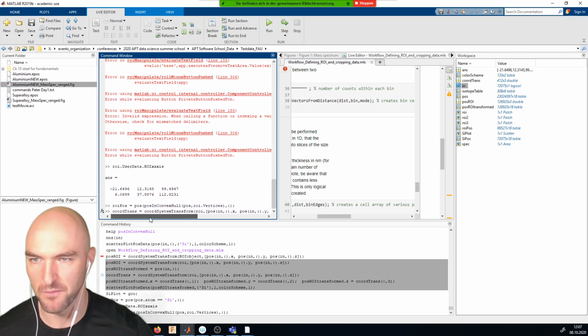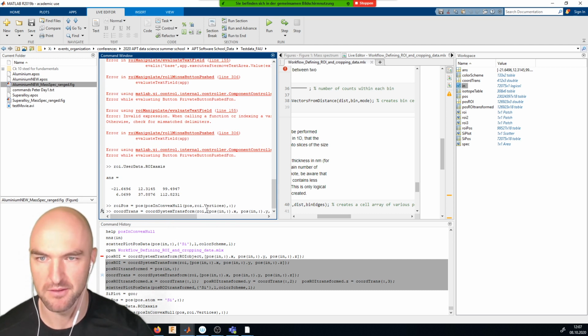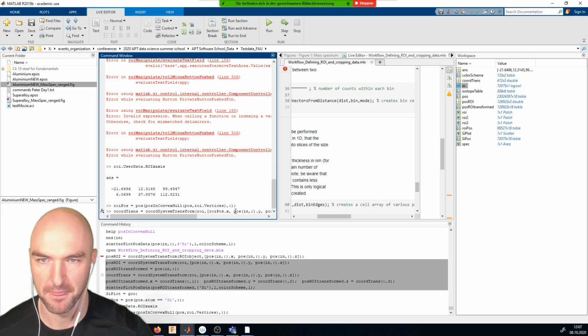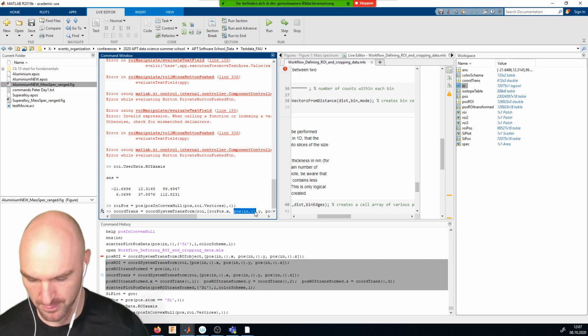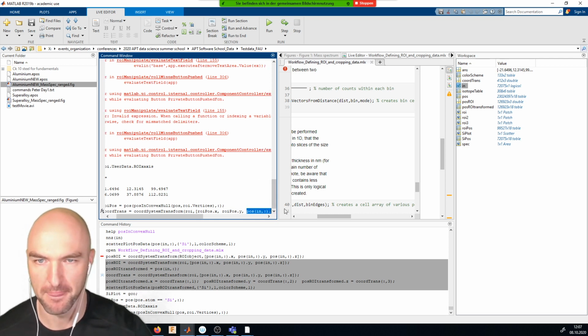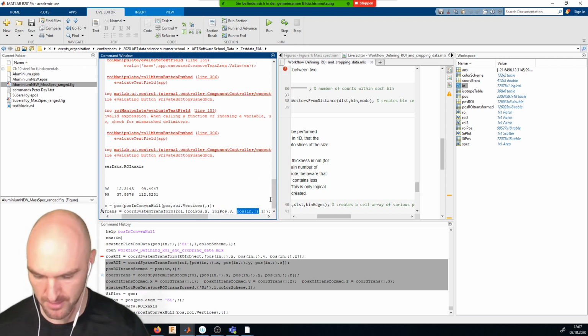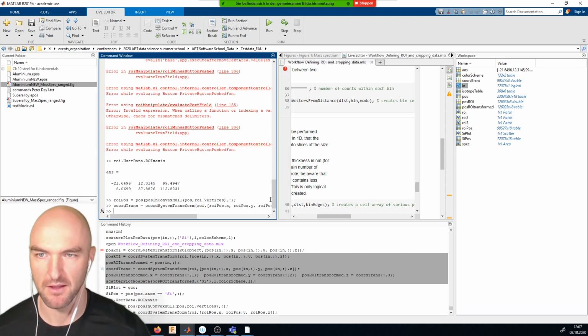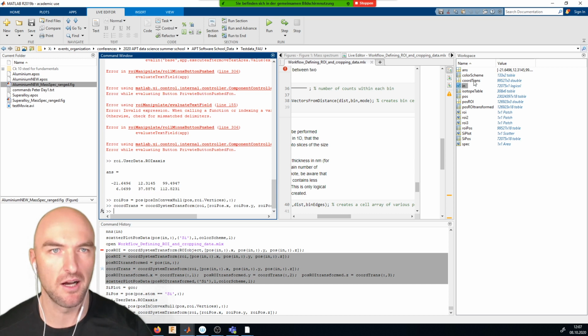And we also want to transform that, so our coordinate transformed is our ROI pos dot x, ROI pos dot y and ROI pos dot z. And this gives us our transformed coordinates. You can see they have the same number of entries as our ROI pos.